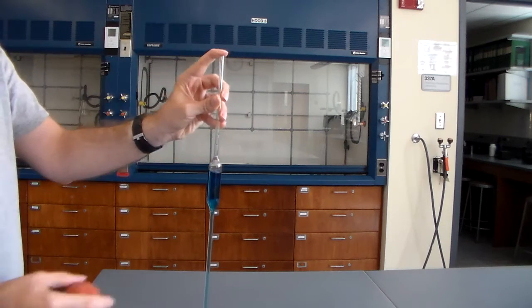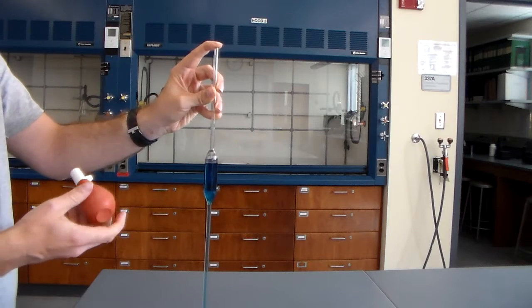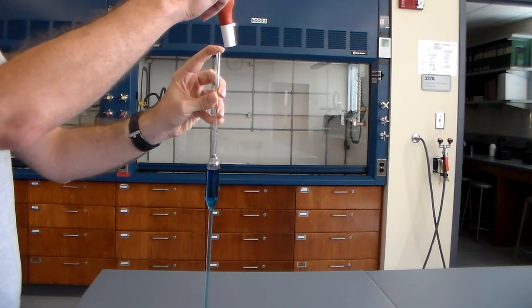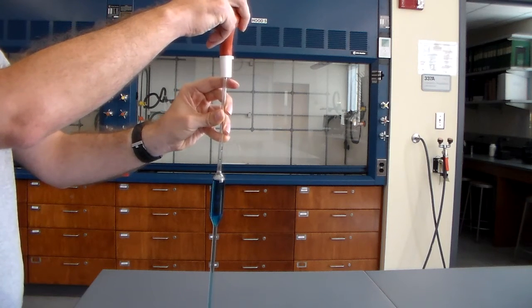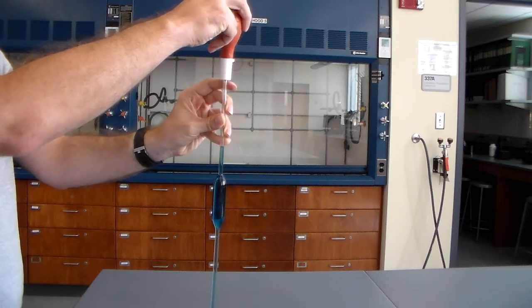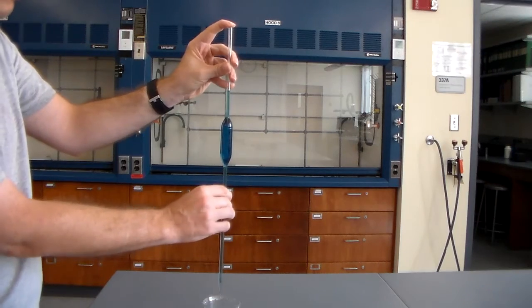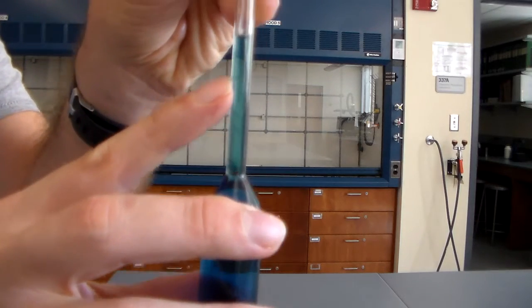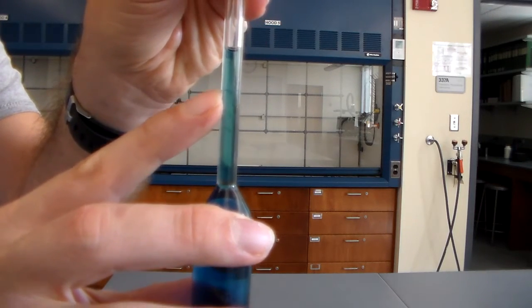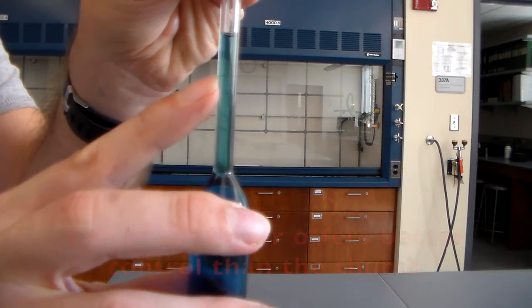So that time, I didn't get it quite filled. So again, I just hold it over here with my index finger. And then I just press the bulb again, and then suck up some more liquid. All right. So you'll notice that right here is where my line actually is. And what we want to do is get it from up here down to my line.